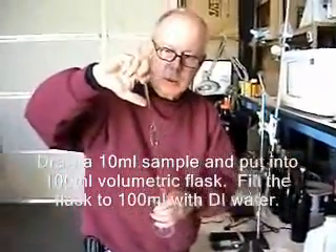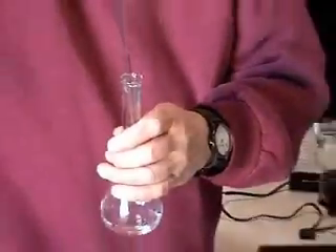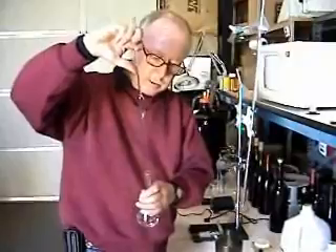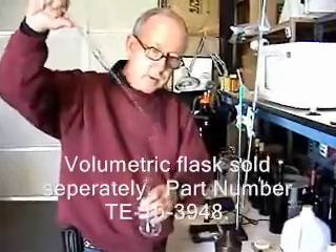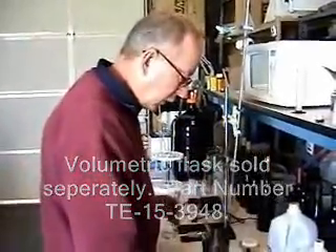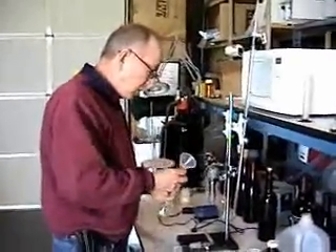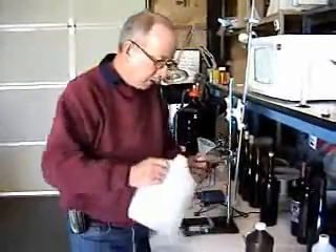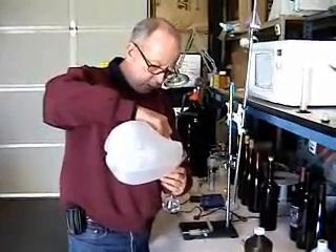On the pipette, there's a little line up here which shows you exactly where you need to get to to get the right volume out. After that has all gone into the flask — you don't blow through, there's still going to be a little bit left in the pipette, and that's fine. Once that's done, we're going to take some distilled water and fill up the volumetric flask to the marker line.